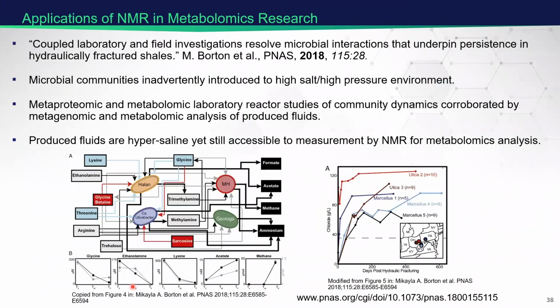The next three articles that I wanted to highlight were EMSL user projects. The outside users submitted proposals to EMSL, and my colleagues in these cases collaborated and produced some really interesting studies. This particular one was looking at microbial interactions in hydraulically fractured shales. These microbial communities didn't exist there. They were inadvertently added there by the process of fracking.